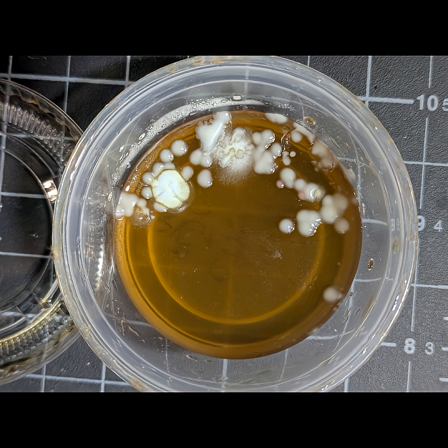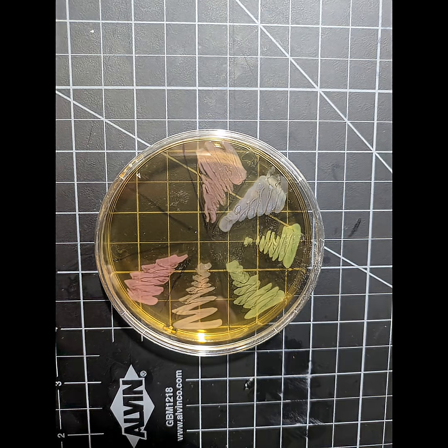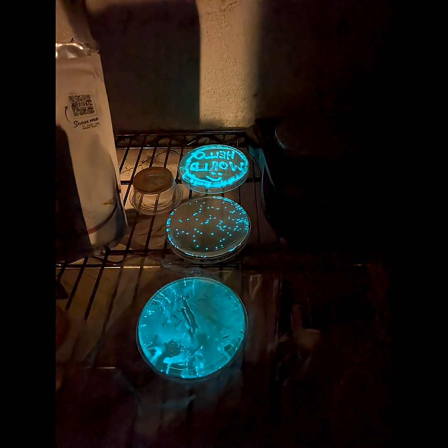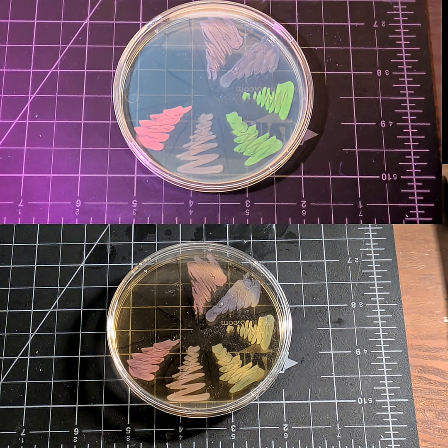I've been growing things in my basement lab — colorful things. Some glow under UV light, and some even emit their own light. This rainbow of colors here is from a set that I bought online, but I'm hoping to make my own additions to the rainbow over time.